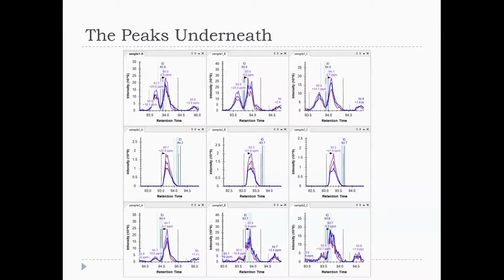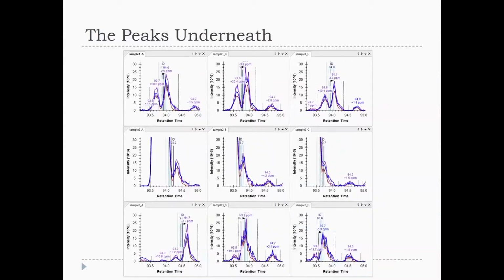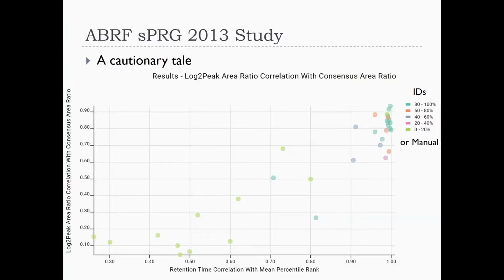But it's really easy to zoom in with Skyline, and so the next thing we might do is zoom in to this one to try to understand what's going on. And actually these are all now, there's a very easy thing that was inspired by Tina Ludwig, we do synchronized zooming in Skyline. So this is all at 30 million ions per second of intensity. And now when we get down to this level, you can see this little thing. But who can blame a tool for not catching that shoulder as a separate peak? No tool is going to catch that, but the ability to see it will allow you to make sense of it.